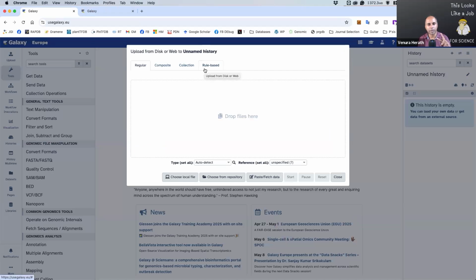This time we are going to do a small change, so please listen very carefully. We are going to make a collection because FastP is not going to recognize individual files. That was the main issue we experienced. If you run FastP using the command prompt, this issue won't arise, but if you run it in the Galaxy environment, you have only two options, if you remember: single end versus paired. We need to upload it as a paired collection.